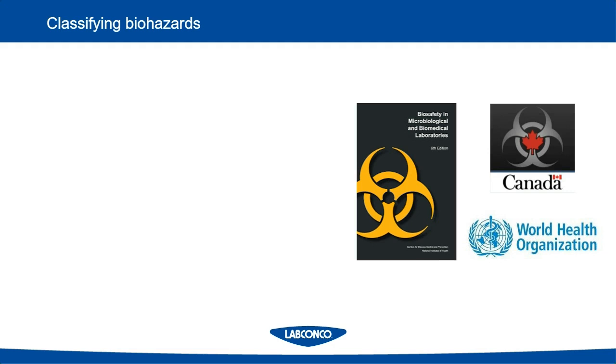Now, oftentimes we get calls from people saying, I have a specific hazard, what do I need to do? And the first place I like to send people when they are asking about how to work with biohazards is to check with their institutional guidance. Odds are your university or your organization has either an environmental health and safety office, or a biosafety officer, or if you're in a small organization, you might contract out with an industrial hygienist, and they might have a background in biosafety.